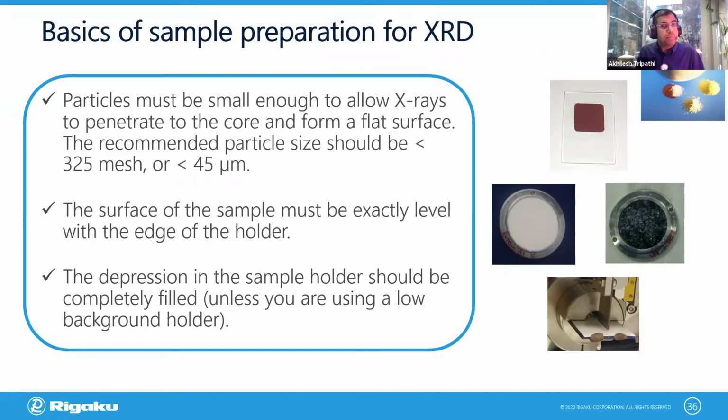Some people do use a sieve, but you can yourself feel if the particle is smooth because it becomes spherical and you do not have this crackling feeling. Sample could also be loaded, as I mentioned, if they're in less amount, in zero background holders. And there are sample holders for plates, thin films, bulks. They exist for analyzing the top parts of the sample.